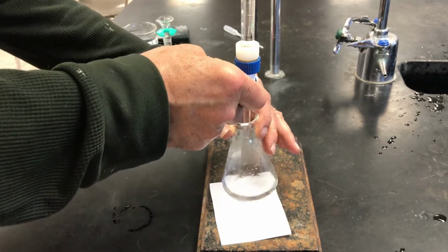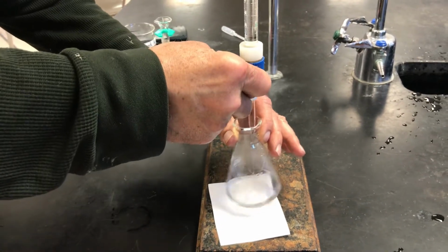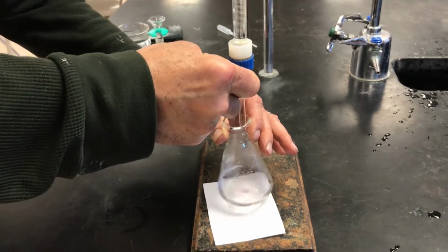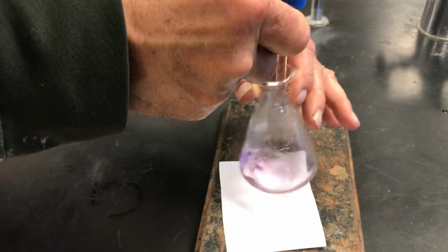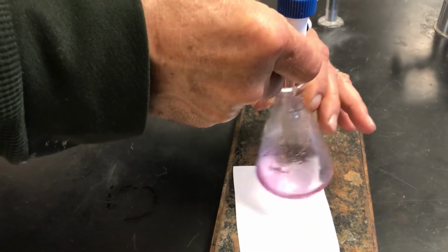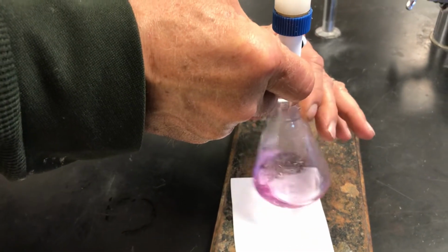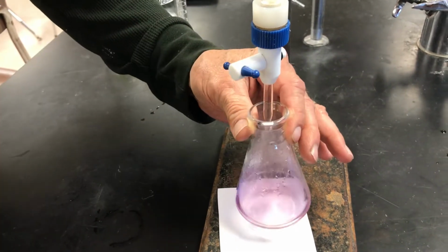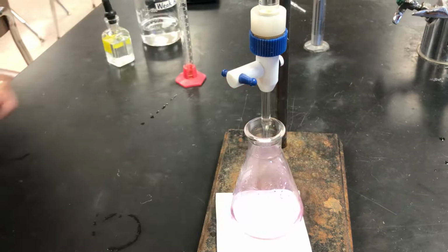Okay, seems like that pink's hanging around a little while. I'm going to try to go a little bit slower here. Okay, I think we caught it.